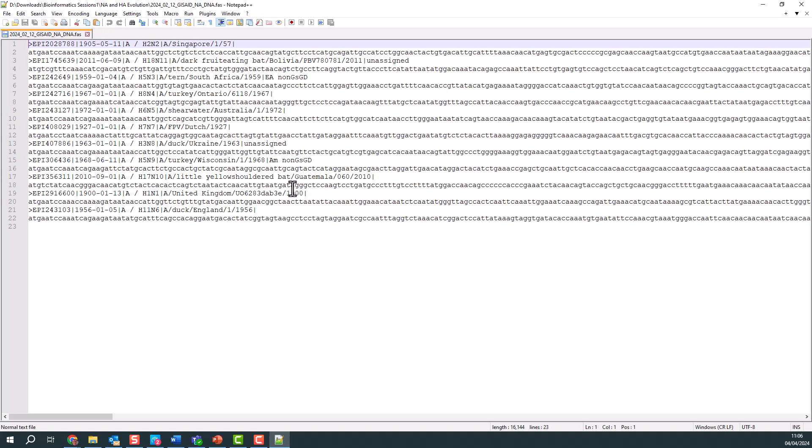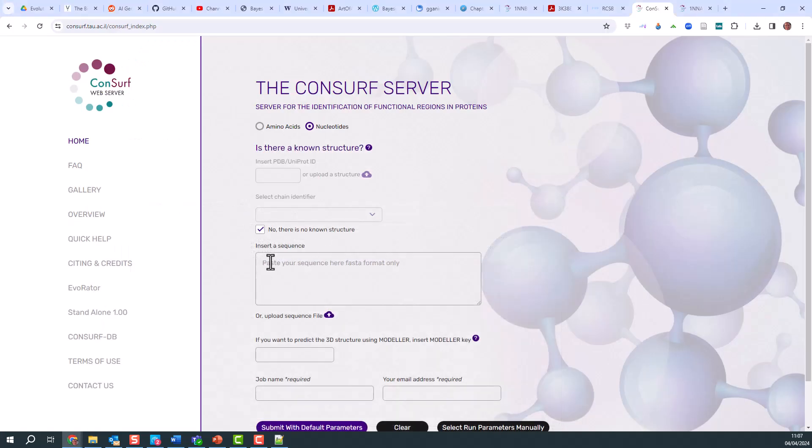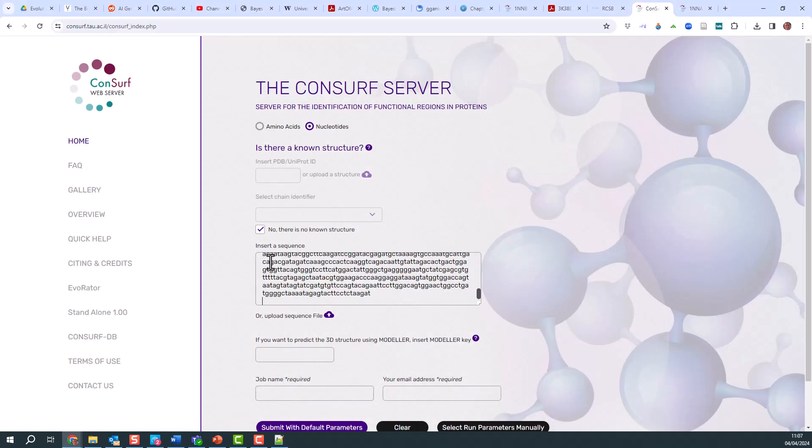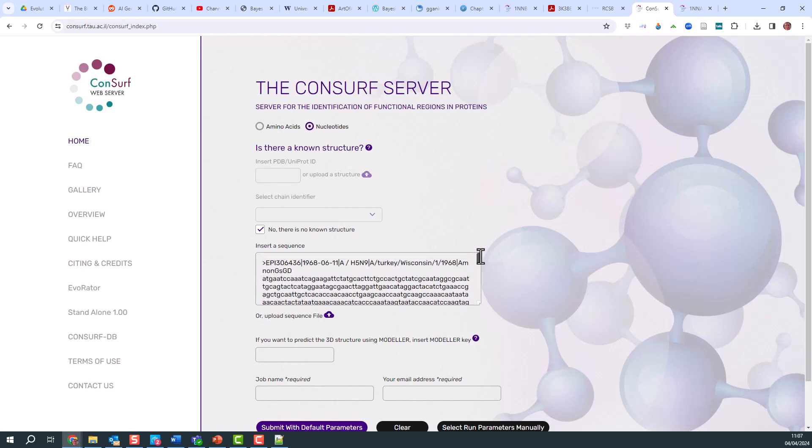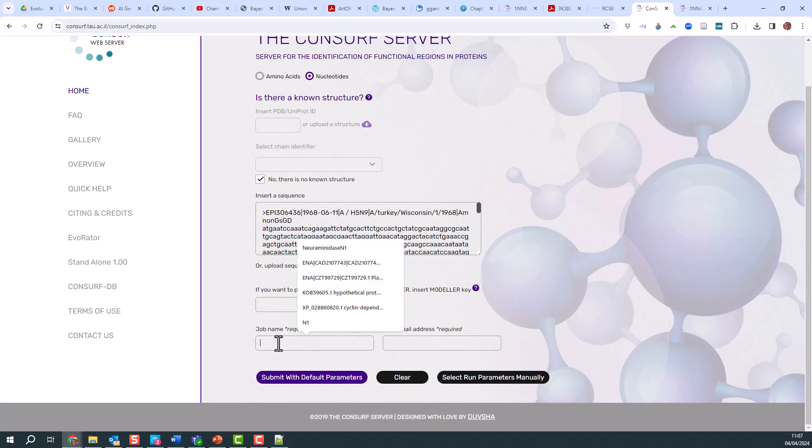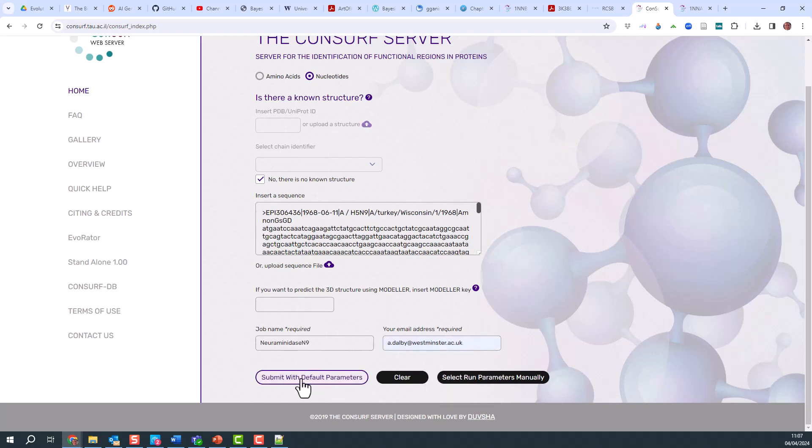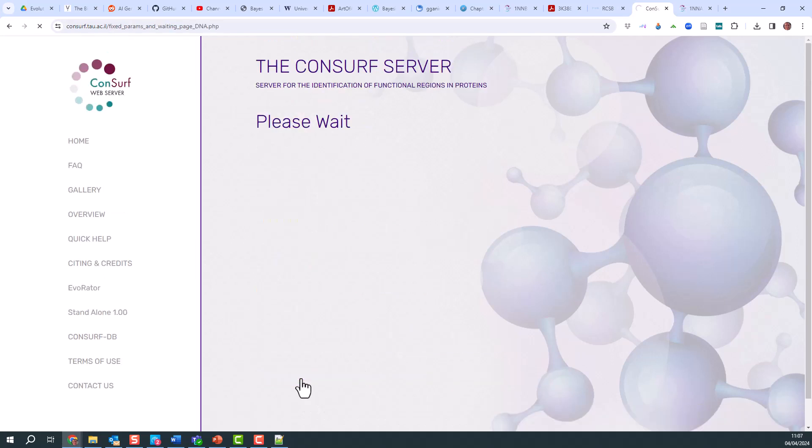The N1 has a 1900 sequence. The N6 was from 1956. What I'm looking for is the N9, which arose in 1968 in a turkey in Wisconsin. This is the particular sequence I want. I need to highlight this sequence and paste it in here. Let me check I've got all of the sequence and it's the right one. Yes, that looks fine. Let's hope that's going to work. I'm going to submit with the default parameters and see what happens. This process can take a long time, so I'm going to pause here.